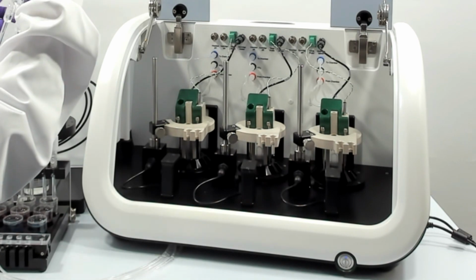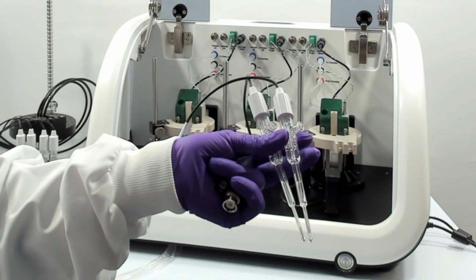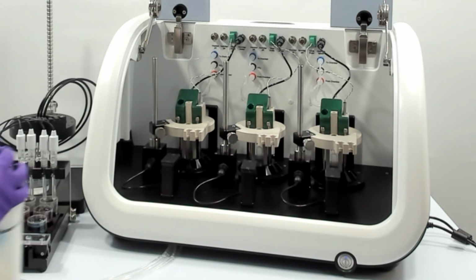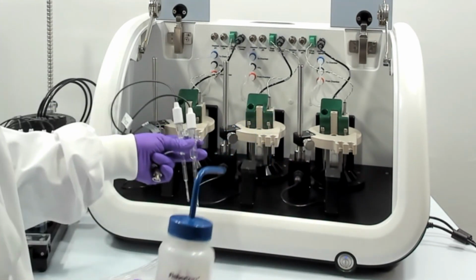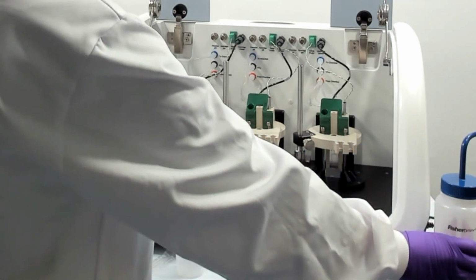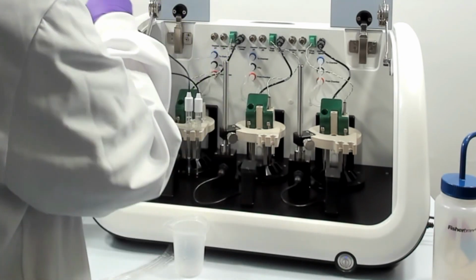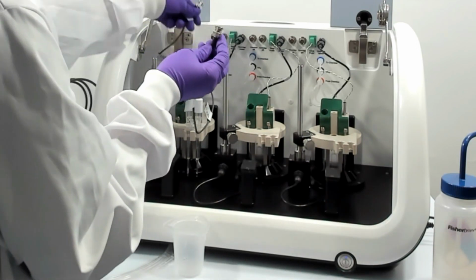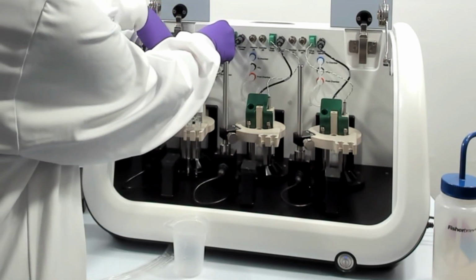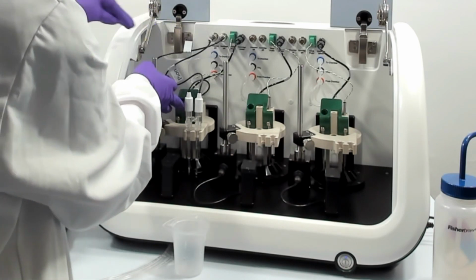So then we want to take our electrodes over to the system, and we want to make sure those are calibrated properly as well. We calibrate those via the SCISSOR N3 software, and these are the same two electrodes for the cartridge and the chamber. The chamber electrode will sit in the left-hand side port in the green section of the cartridge holder, and this will measure the pH inside the bicarbonate buffer in the chamber, and then signal to the system when to allow the CO2 burst to help mediate the pH of the chamber.